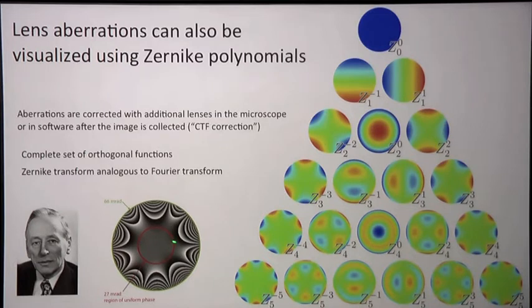But ultimately, our goal is to create a beam that has a nice uniform region of phase in the middle, and that's the bit that we want to actually image our sample with, because we want our sample to be shifting the phase of the wave, not our optics or some other thing.